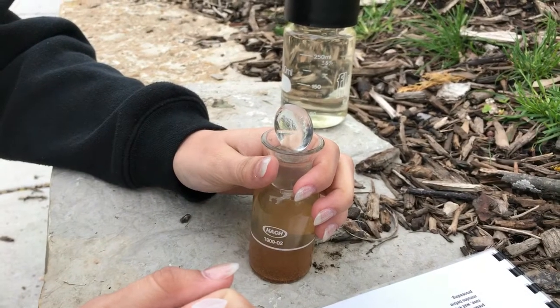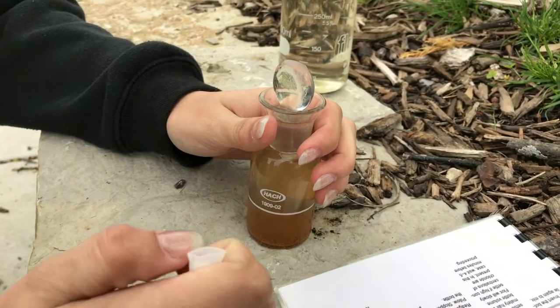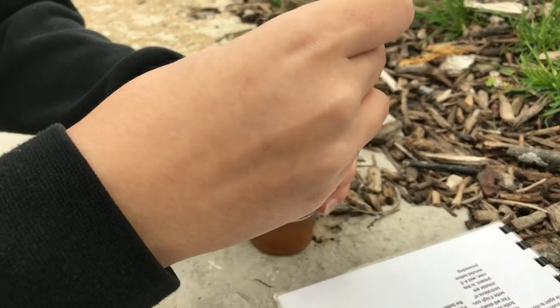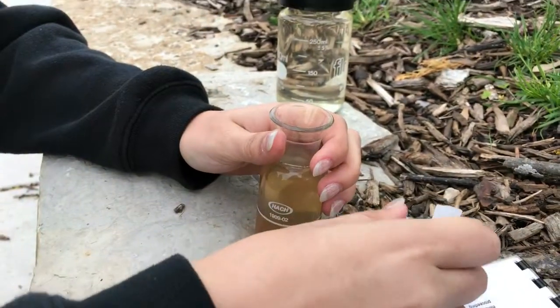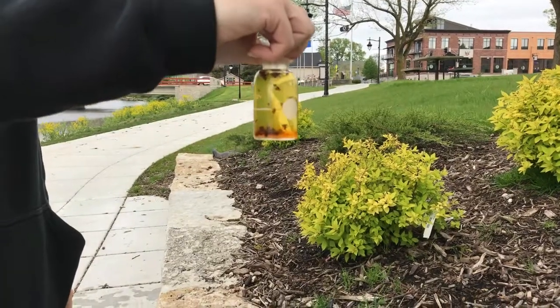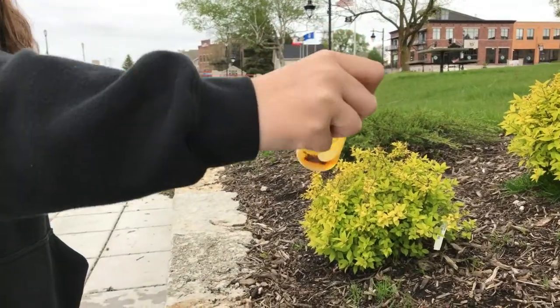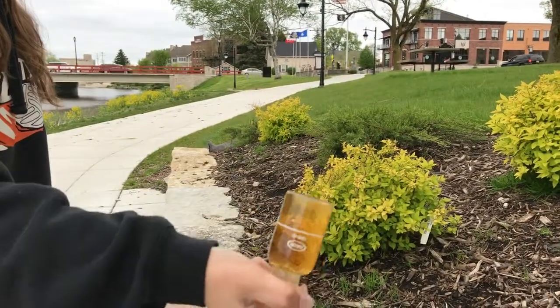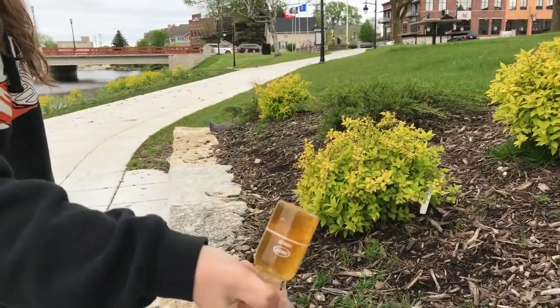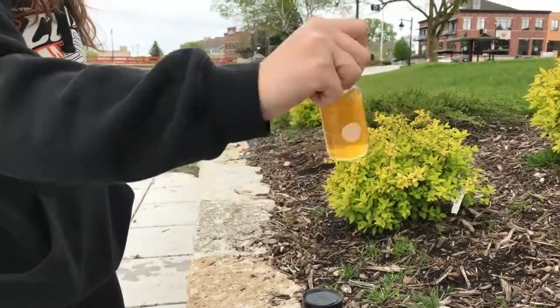Now that the orange portion of the solution has settled to the bottom once again, take the open packet of chemical number three and empty it into the flask. Now that the solution has turned into a shade of yellow and chemical number three has been emptied, invert it once again until the chemical is dispersed among the solution.